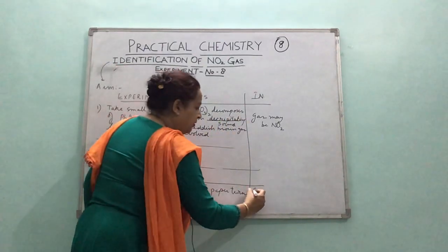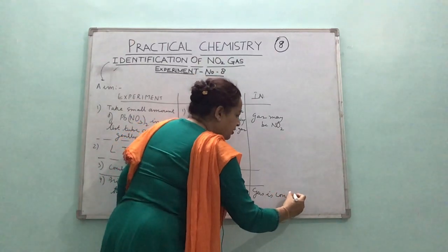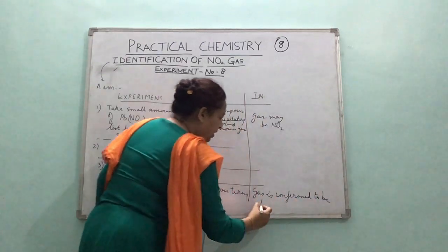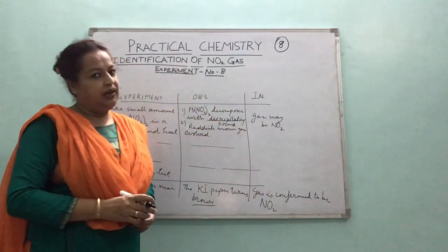And now you can write down: gas is confirmed to be NO2. Gas is confirmed to be NO2.